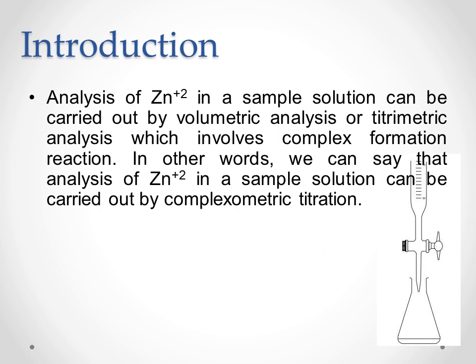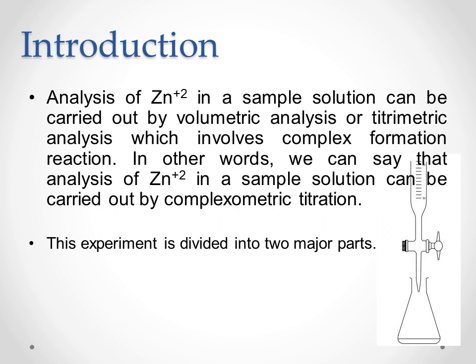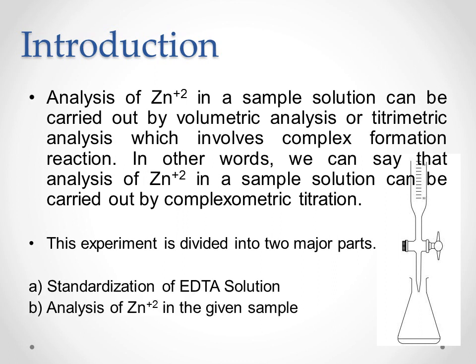So this experiment is divided into two major parts. Part A is standardization of EDTA solution, and part B is analysis of zinc plus 2 in the given sample solution. EDTA is the ligand here and zinc plus 2 is the metal solution.